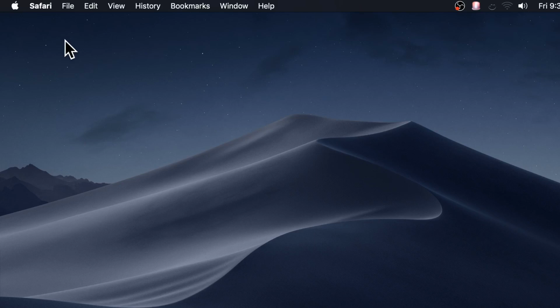Hello everybody. Today I'm going to show you how to install some software that's pretty important for docking.